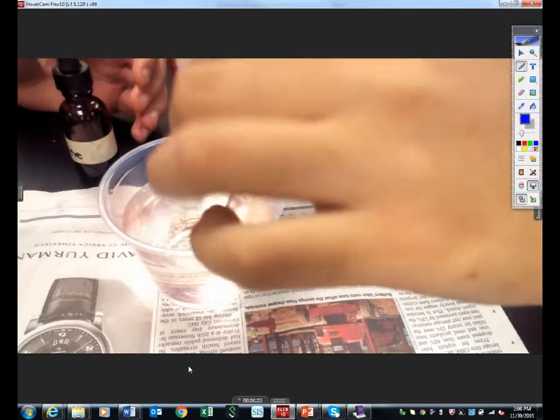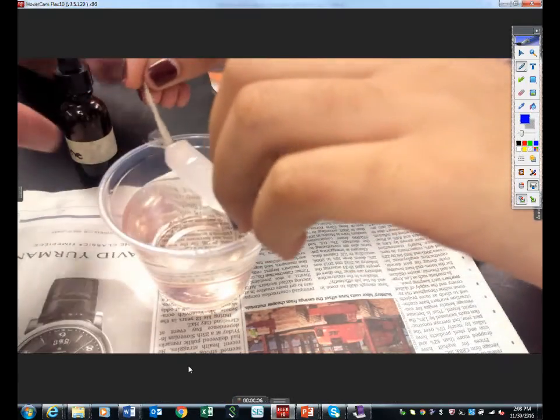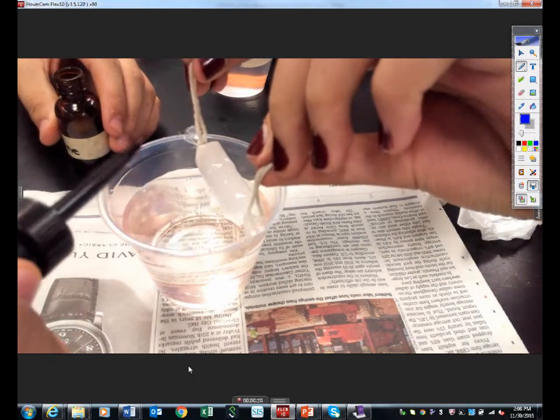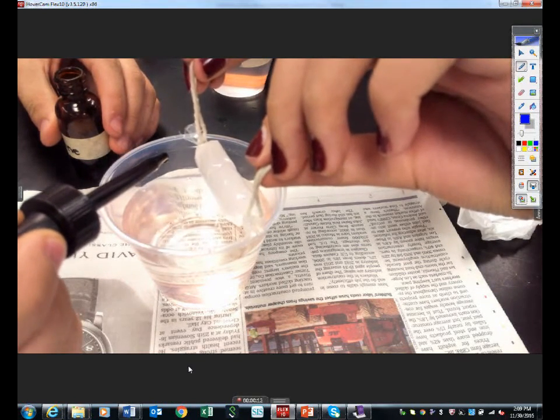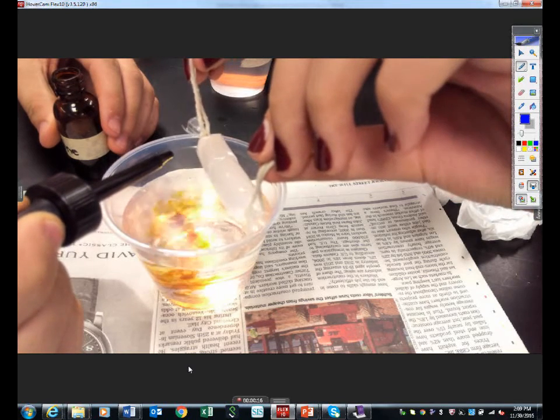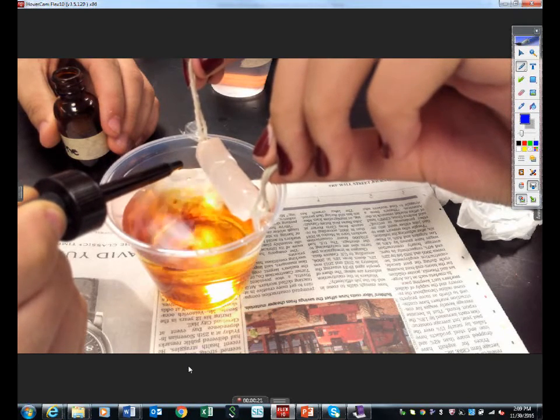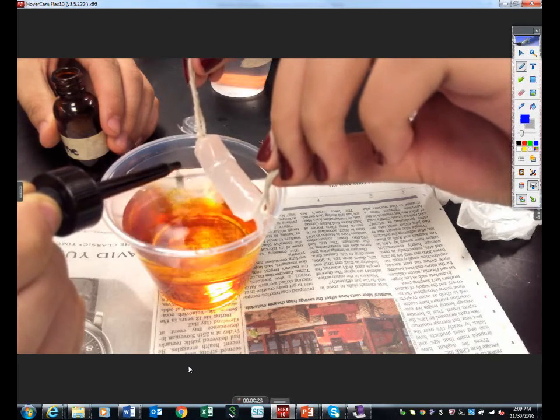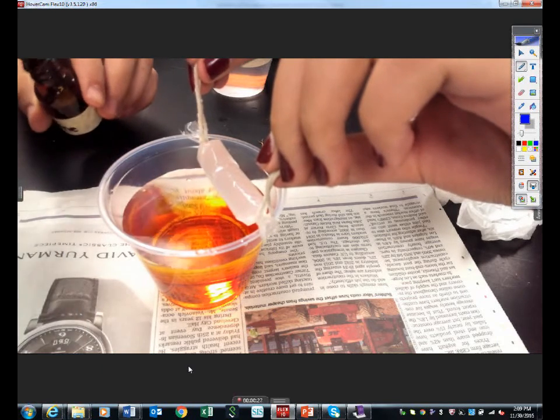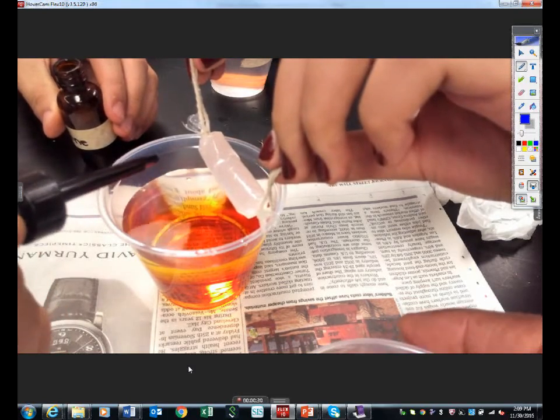All right, so guys, some of you have already submerged your little bag in. This group's going to add the iodine — go ahead and add it. They're going to add 20 drops of iodine. You can go and drop it in now, even though you're still adding some drops.